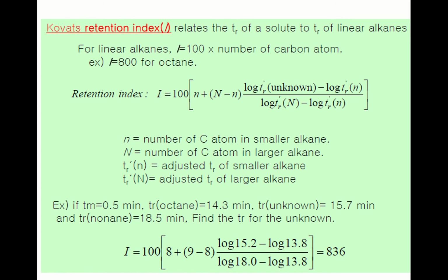Here is an example. The adjusted retention time is what you measure minus the retention time for the unretained molecule, which is methane.